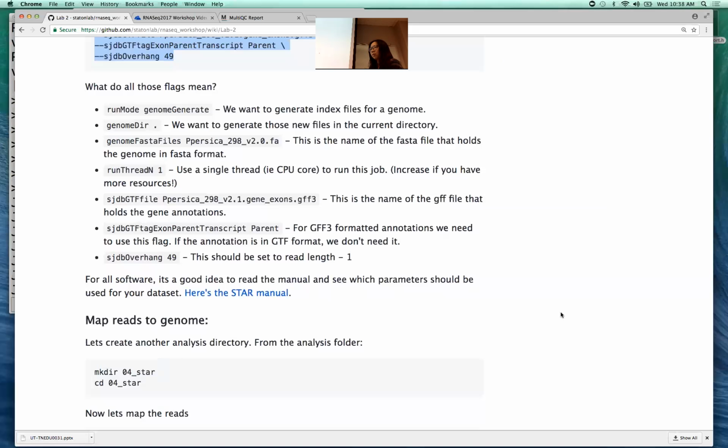And this is conceptually the same as when you're running BLAST. We'll do BLAST tomorrow, and it's very much exactly the same. Now, most of these read mappers, STAR and Bowtie, are not going to deal with anything below about 96 to 98% similarity between the reads and the genome. If you want to go below that, you need a specialized mapper. We're also looking at STAMPY and GSNAP. They're significantly slower. Something like STAR is crazy fast. If you think about what it's actually doing, it is crazy fast.